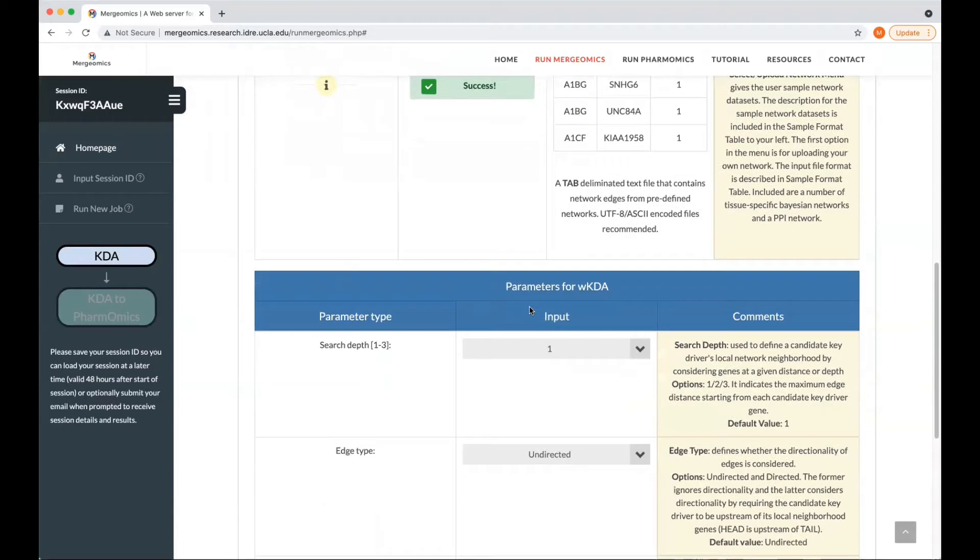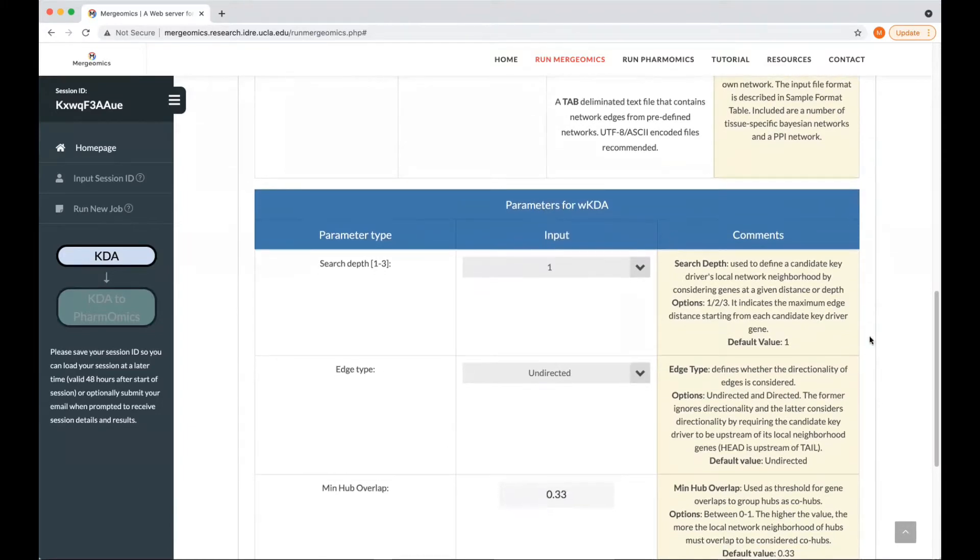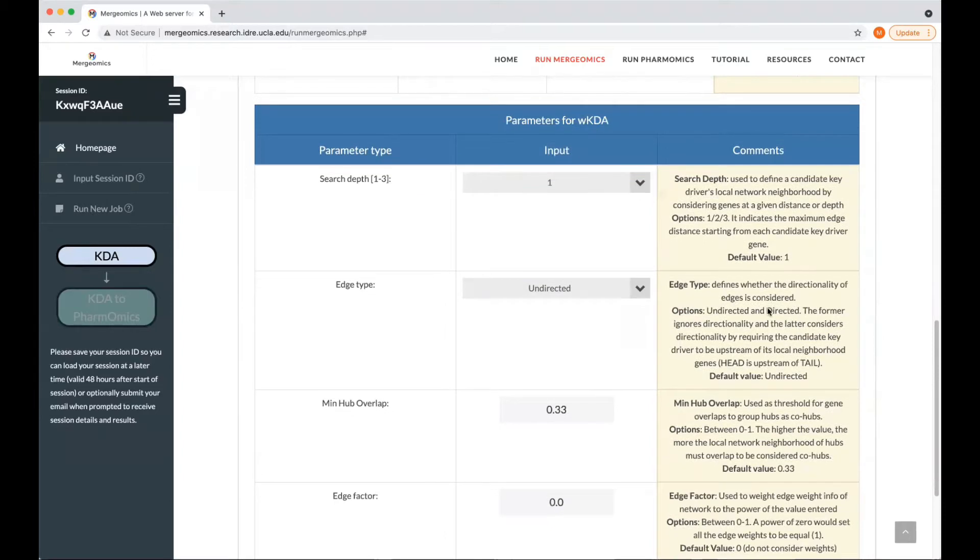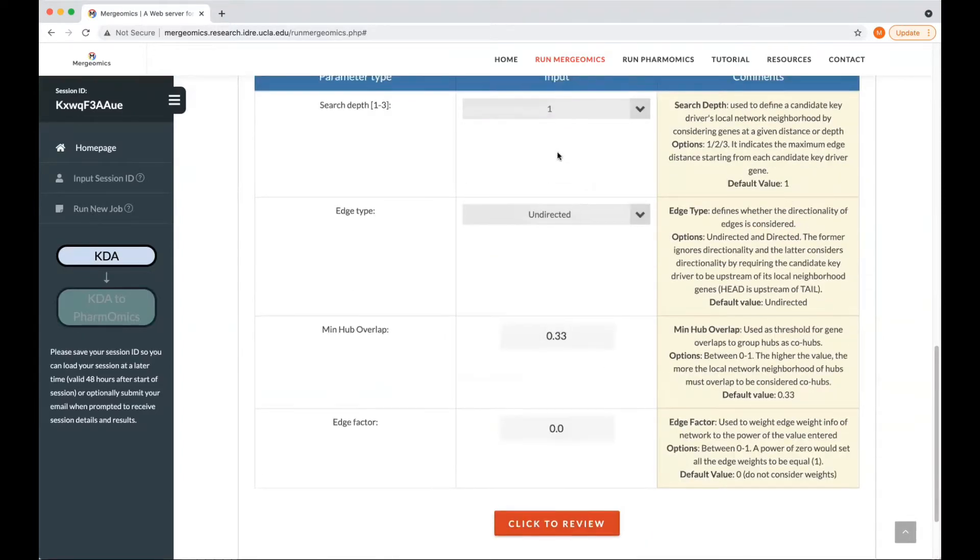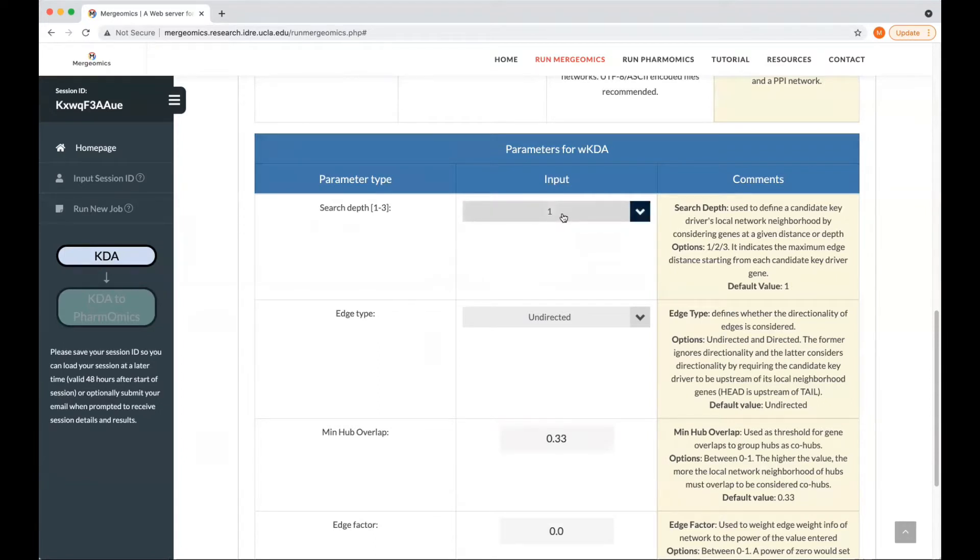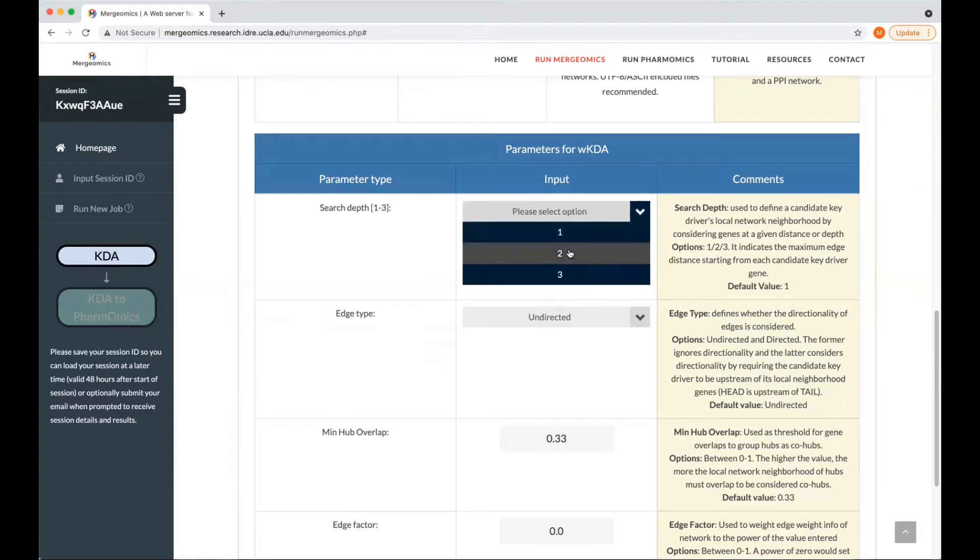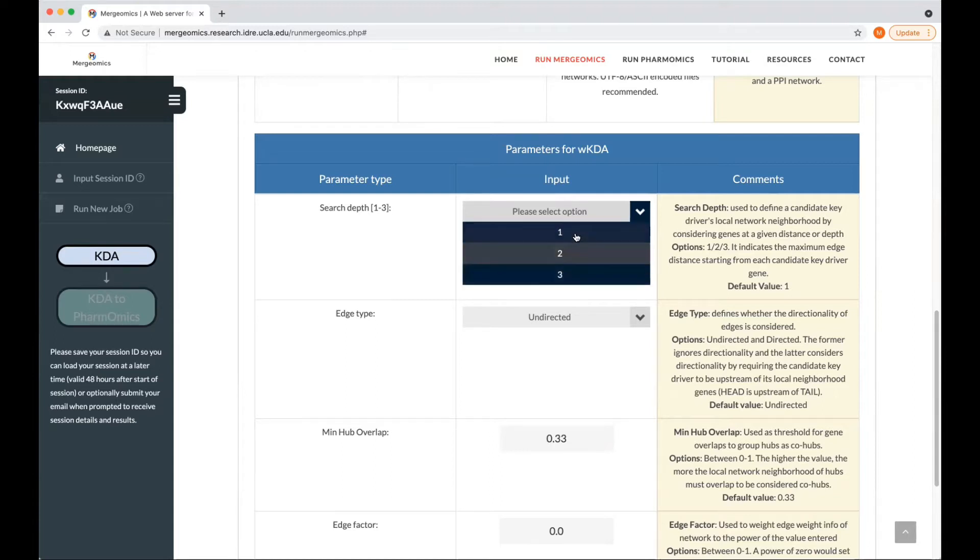Next is to select the parameters for the key driver analysis, where we highly recommend to stick to our default values, which is explained in the comments on the side. The search depth determines the search distance used to define the key driver's local network neighborhood, where one refers to one connection away, two is two connections away, and three three connections away. We'd highly recommend to stick to one, but you can increase this to two or three for more sparse networks or for smaller input gene lists.